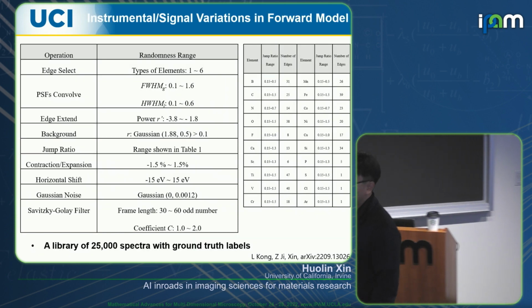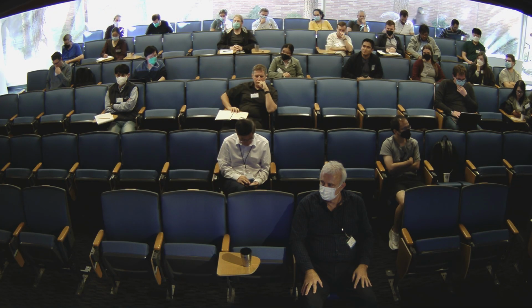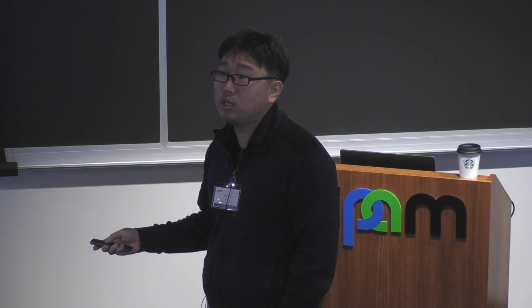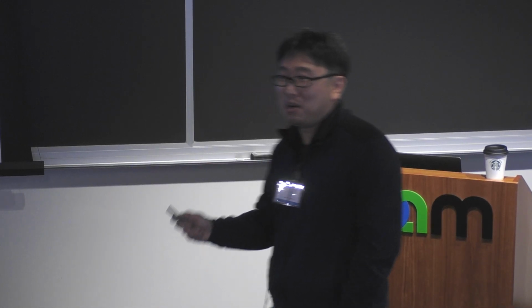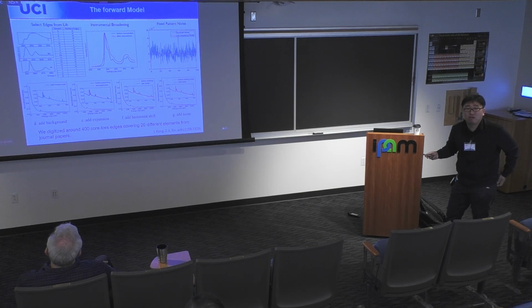Sorry, one question. Are you sure your Gaussian function captures all the information of your experimental data? No, it shouldn't, as we just talked about. Oh, you mean the shape of the curve? That's a multi-Gaussian fit. We know a Gaussian is not complete. It's for statisticians, and you can write a thesis on multi-Gaussian kernels. But you want to get quantitative results. We know the Gaussian kernel is not a complete set; you always truncate somewhere, and it can fit things pretty well.